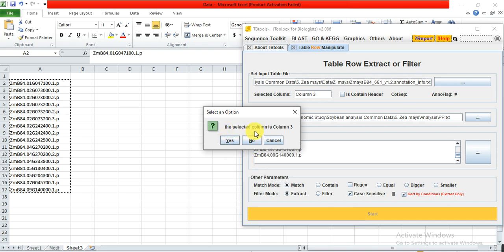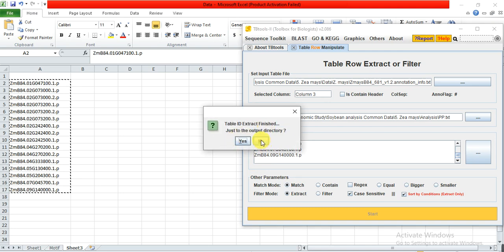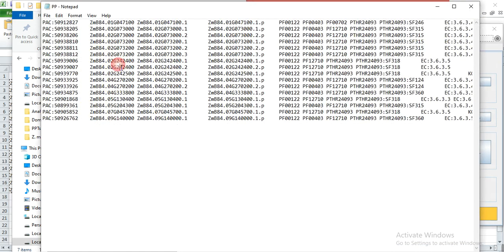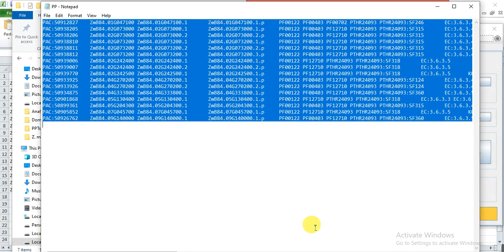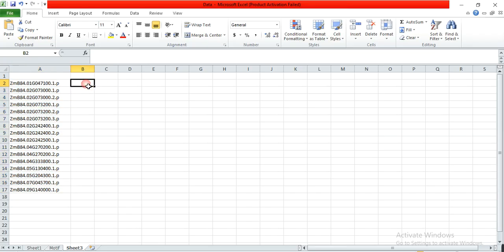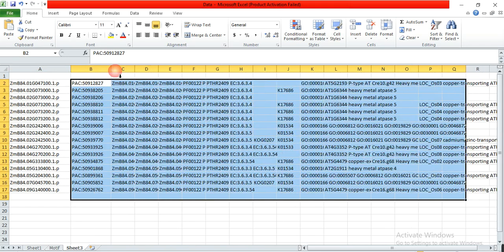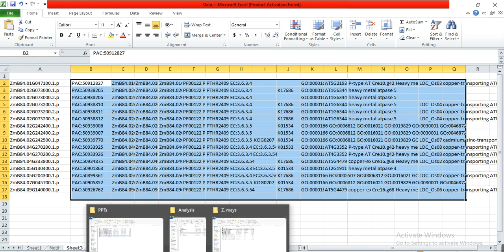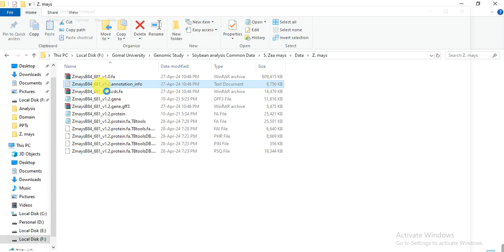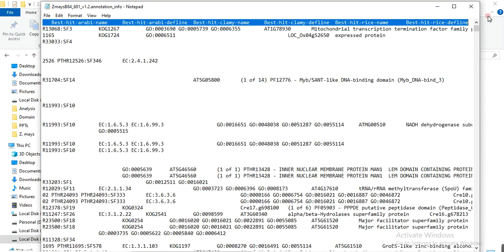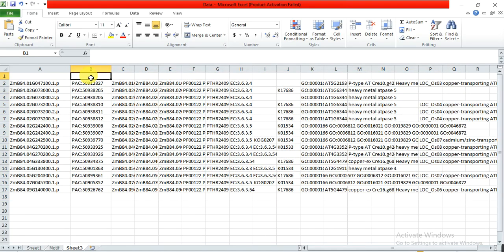It confirms that column 3 is selected — click Yes. Our data is selected. Open the output file, select all, copy and paste it. Now we need the headings for the columns, so open the annotation file and copy the first (heading) line.